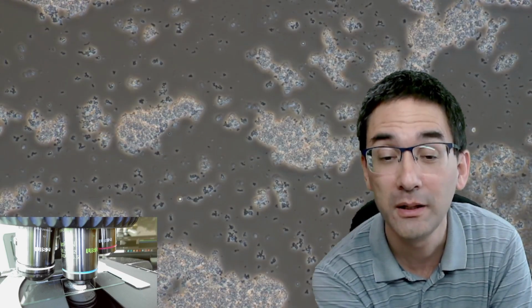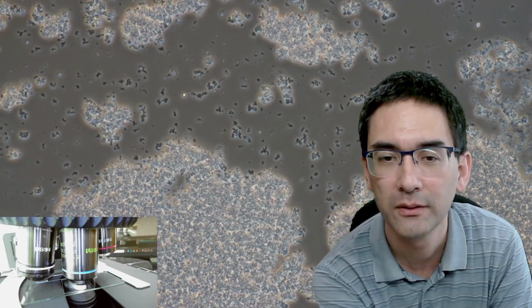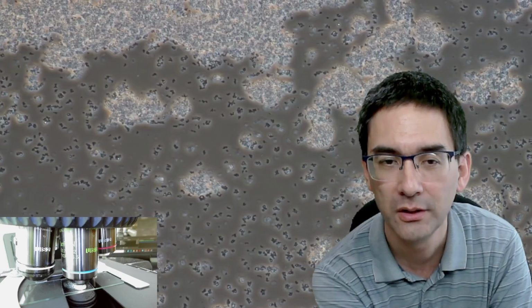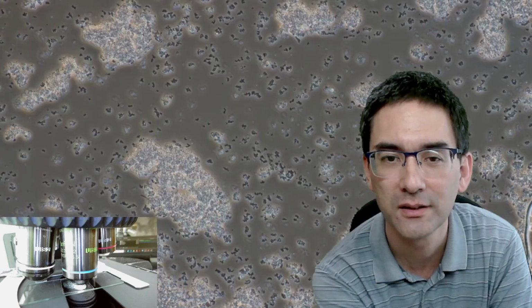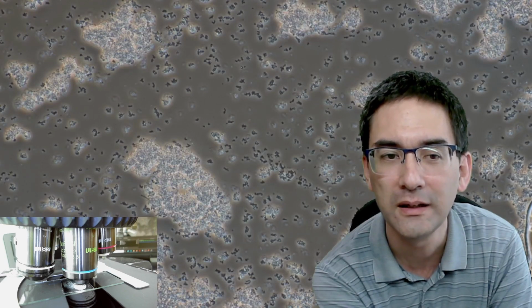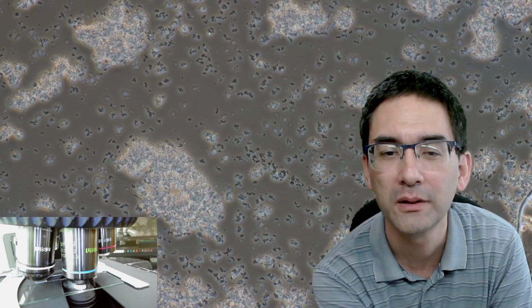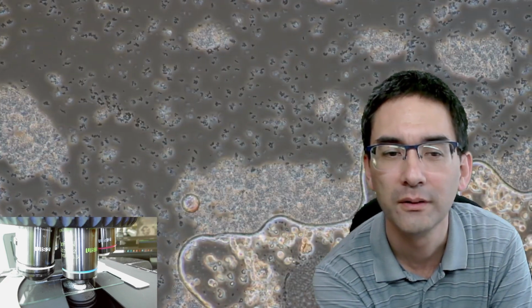You probably already know that I have also another microscopy YouTube channel, and I also made videos there where I put yogurt under the microscope. Yeah, here there are many bacteria. That's nice. I include a link, and then you can look at those videos as well. Look, many yogurt bacteria. Here, the round things, these are air bubbles over here.